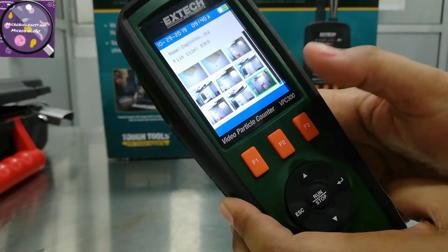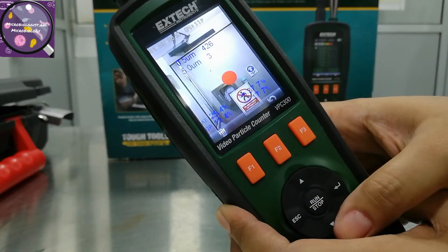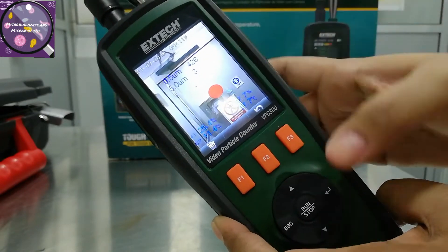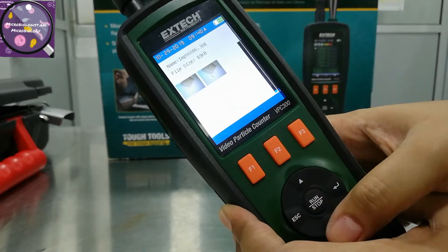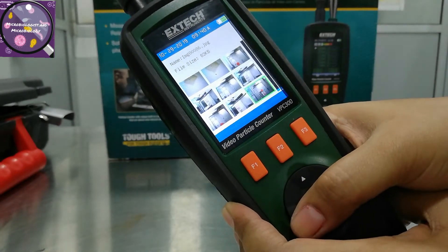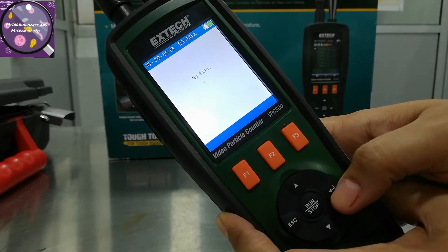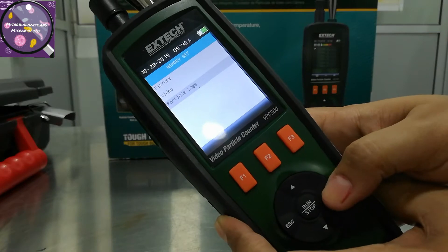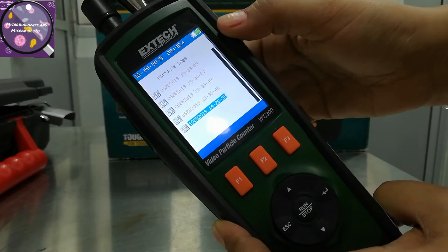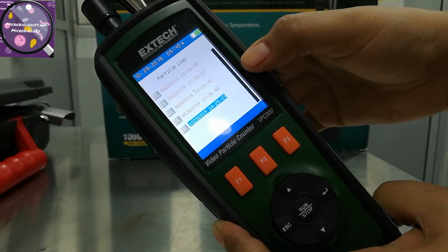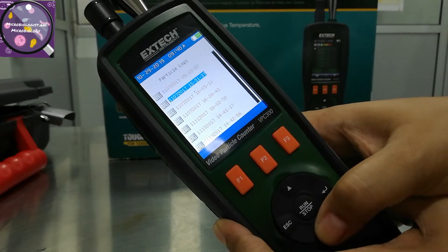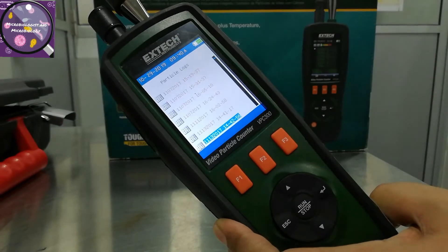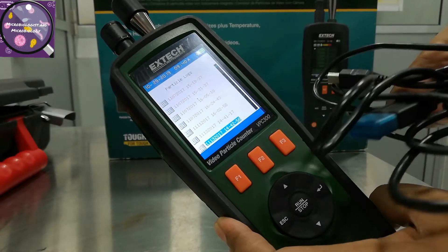Here is a problem with this device — since it's a video particle counter, we have to take pictures so the area can be identified. Otherwise, you have to store the data in your computer where the software is already installed. These are my last logs where I have taken the particle count data, which you can see on your PC when you use this USB device.